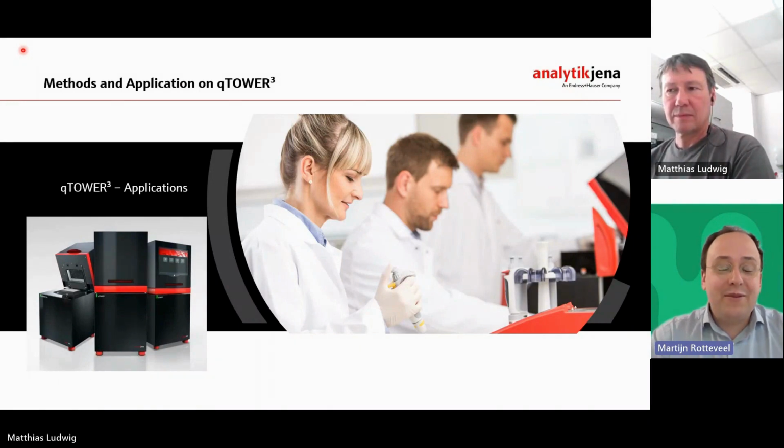Today's webinar will be about the principles of qPCR and how we can use the qTower PCR system by Analytik Jena to provide us with the best possible results for our experiment and make sure we can impress all our colleagues with the results we get.